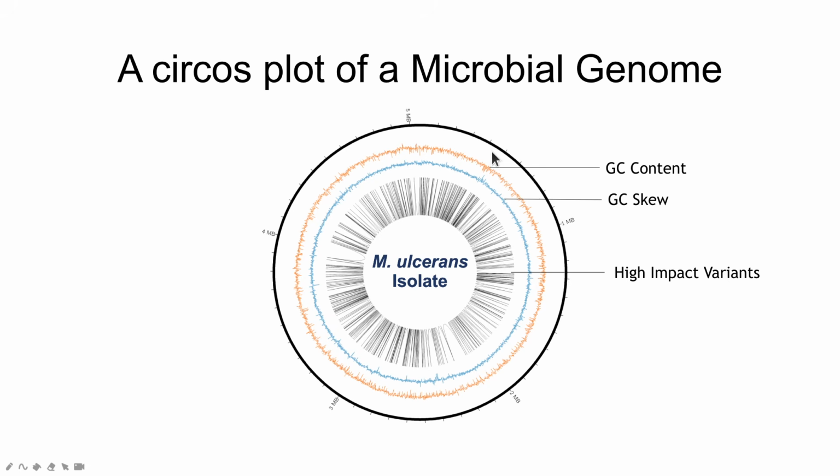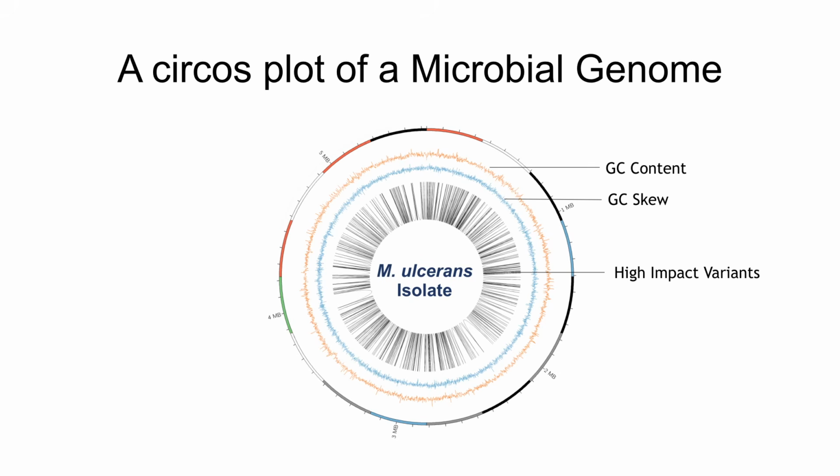Now, this is a single chromosome. And if you want to highlight certain regions of the chromosome, you can do that by using custom colors, like in this particular plot here. So that's what you need to know. I'll show how to get example data for this tutorial, so don't worry.